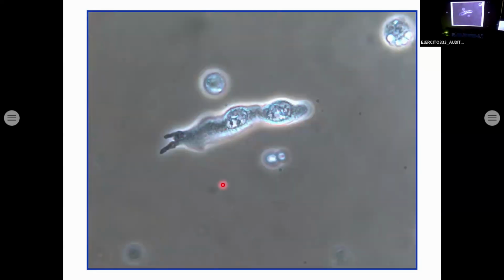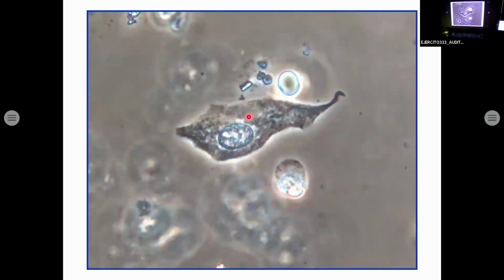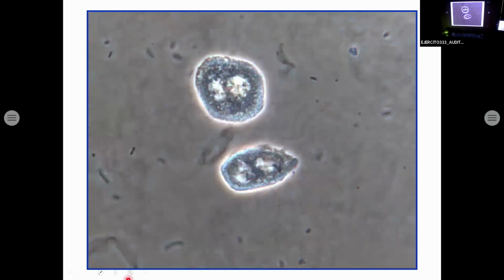And now, atypical cells, you see here, unusual shape and size. Again, elongated cell with two nuclei and well evident nuclei. Unusual shape, very unusual, large cell with the chromatin aggregated around the nuclear border. Multinucleated cell. Again, large cell, very large cells, unusual shape and polynucleated, multinucleated.